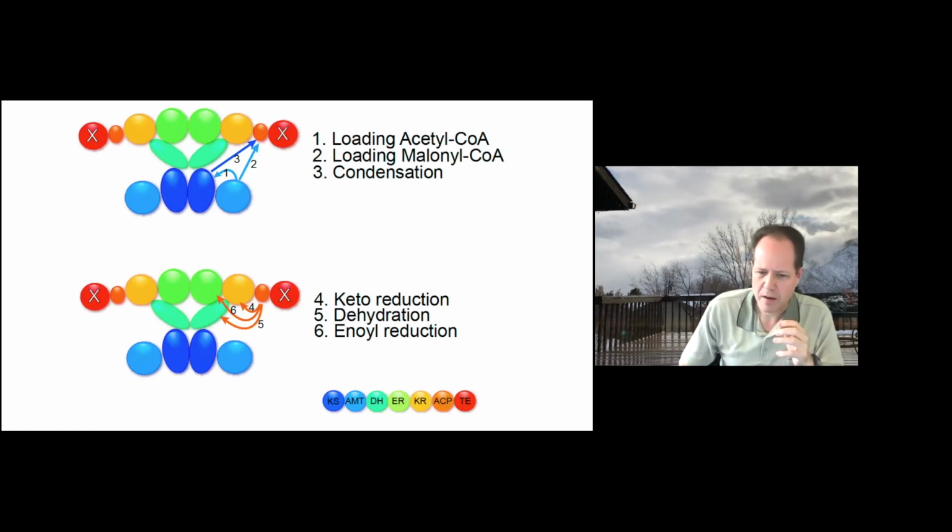This is a multi-enzyme complex responsible for building hydrocarbon chains in the human body. There are 7 different enzymatic activities present in this complex. This is fatty acid synthase, by the way. We're looking at a particular variant here, which actually is missing the 7th enzymatic activity. But still, basically, you have a substrate which has to visit all of these different sites in this complex.